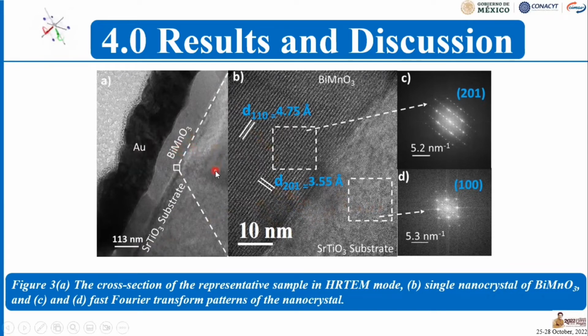Bismuth manganese oxide film. We have here showing the thin film, and here is the substrate, strontium titanium oxide, with 113 nanometers.